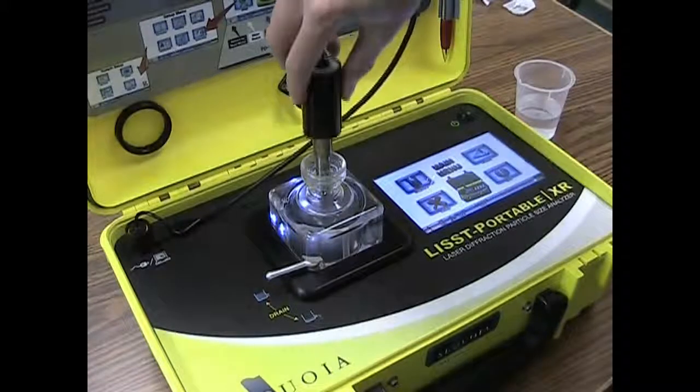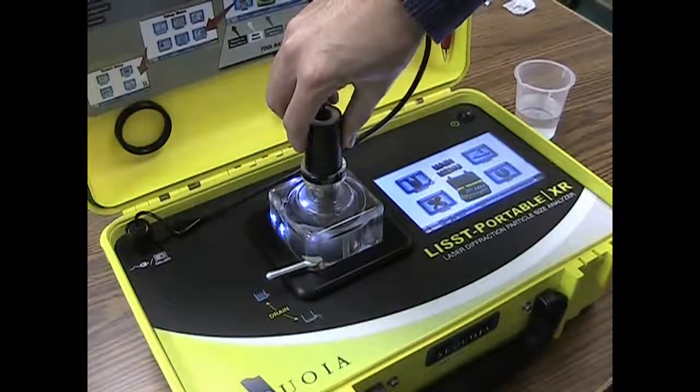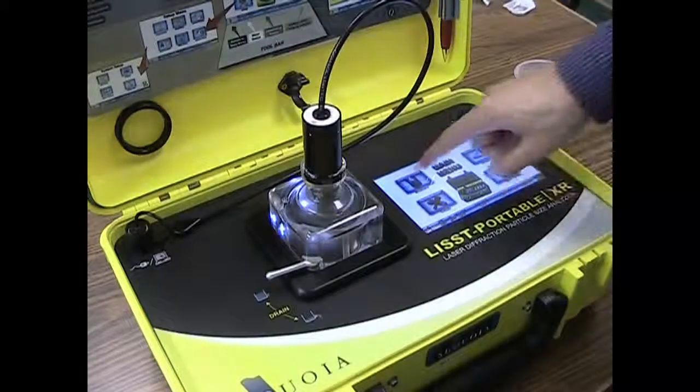Replace the ultrasonic probe and turn on the mixing pump. This will ensure your dry sample is well dispersed in the sample chamber.